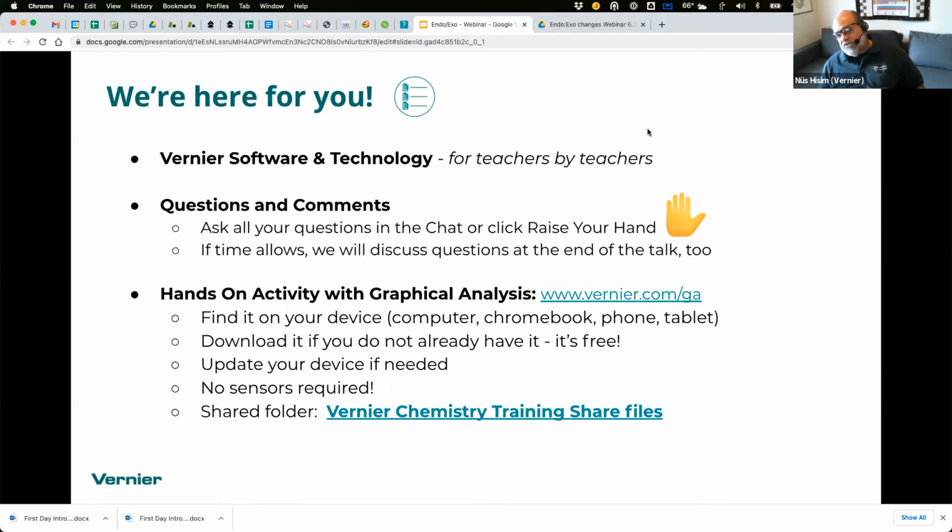So one thing I would suggest, if you want to play along, I set this activity up so that you can play along. So this whole year of COVID, and people having all kinds of different arrangements, wouldn't it be nice? This is a rhetorical question. Wouldn't it be nice if you could do a demonstration and your students could get live data from you?